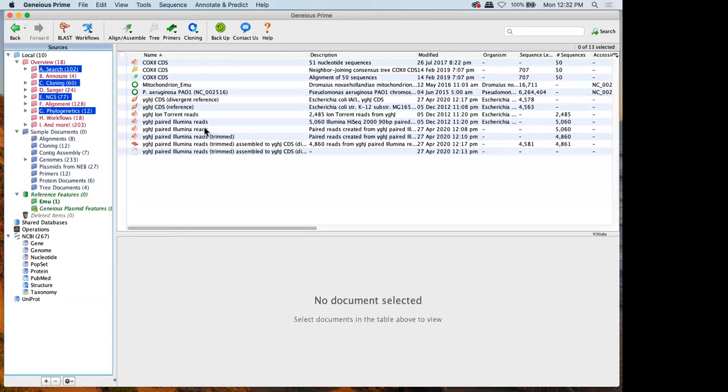All of those documents from those folders are going to appear in your documents table. If this is something you're just doing once or twice and you don't want to create multiple aliases, that might be a great workaround. It's completely up to you as to what makes most sense for you. Hopefully that makes sense.